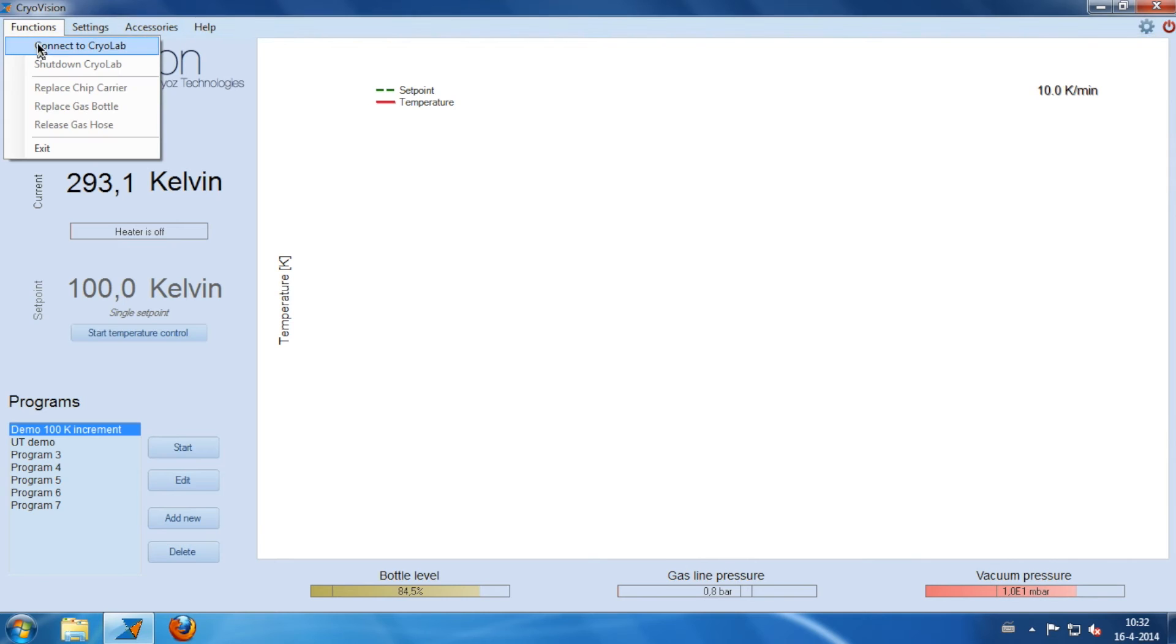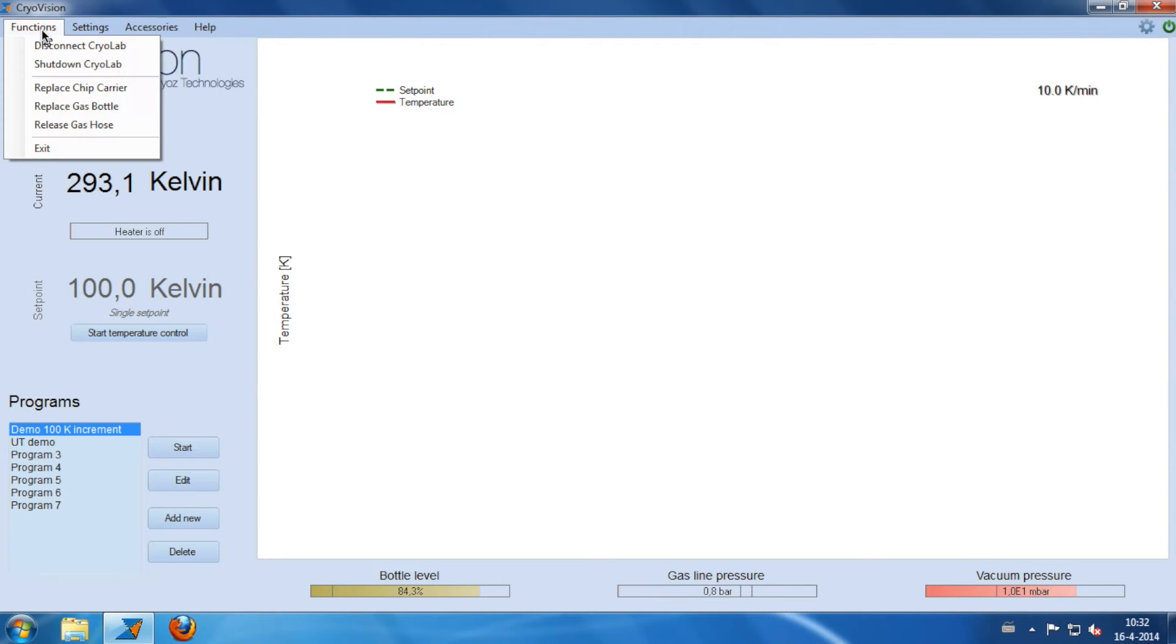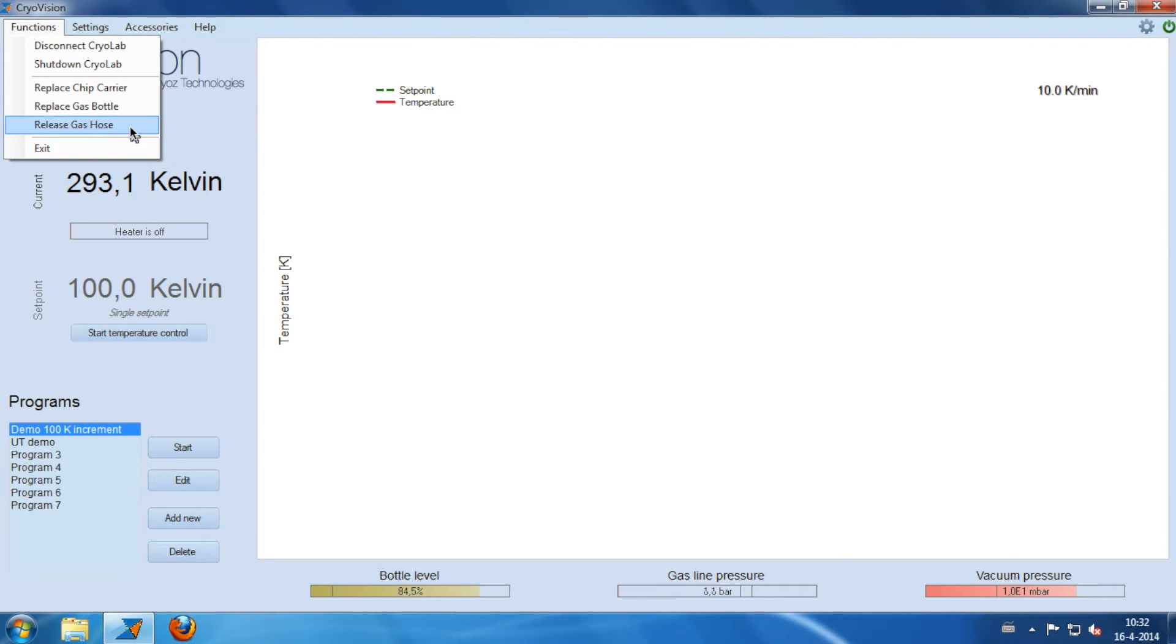You can connect to the system by choosing the option from the menu. Under functions, you can find all system functions. You can turn off the system, replace a carrier, or start the function to replace the pressure bottle, or to disconnect the gas hose.